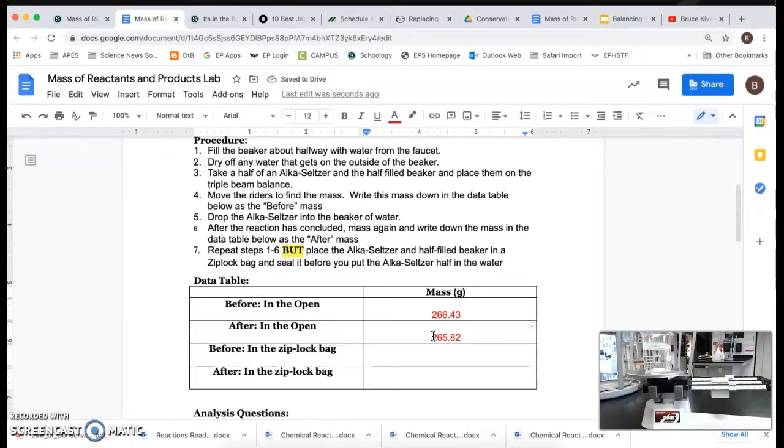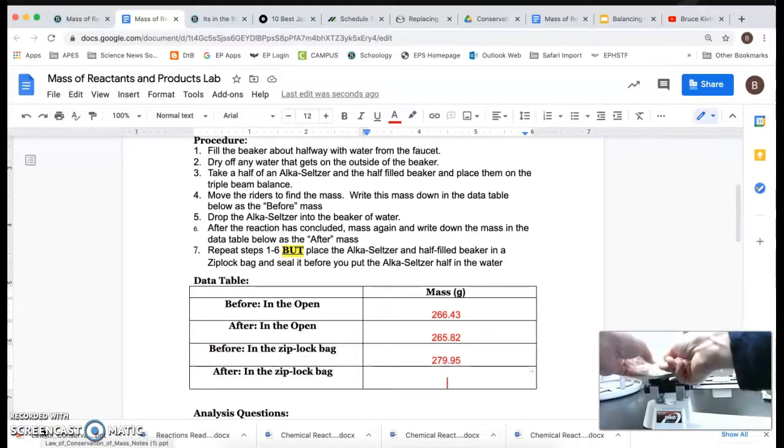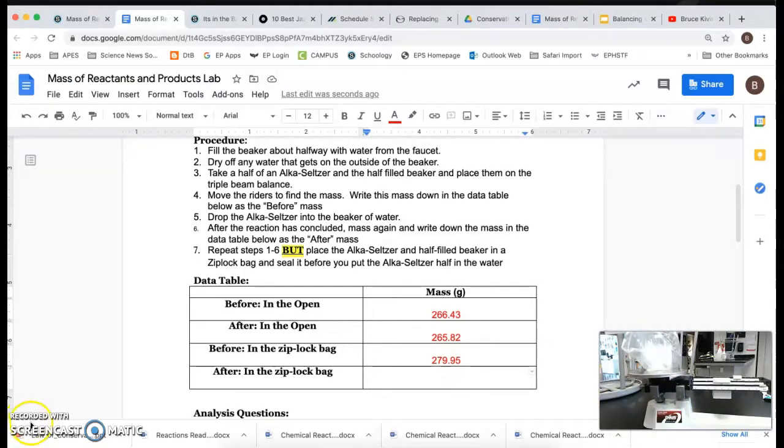Now I'm going to pause again, and I will get part B set up. So I will see you back in a bit. I think you may have seen me get it in, and then I think I paused. So you can see the Alka-Seltzer tablet is fizzing away. We'll be back in a few minutes, and we'll record the final mass. So see you in a bit.